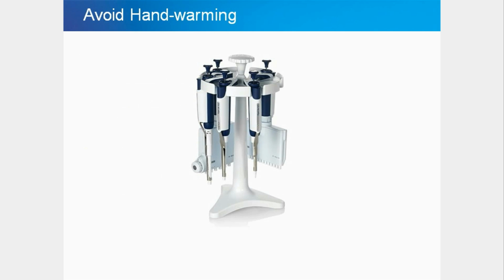Another source of error many people are not aware of are hand-warming effects. During regular use, heat is transferred from the user's hand to the body of the pipette. Prolonged handling of the pipette, such as during micro well plate work, can result in a noticeable deviation in pipette performance.